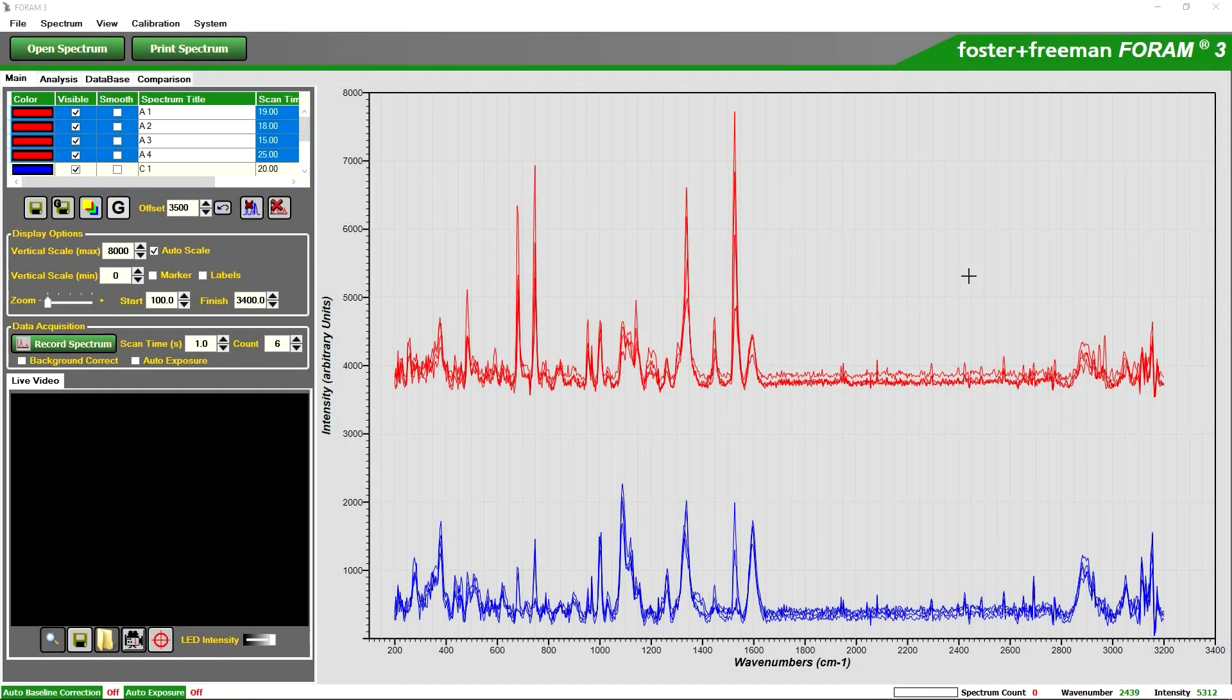In this example we were comparing a series of counterfeit 50 euro banknotes. Specifically we were analyzing the yellow stars on the front of the banknote themselves and trying to establish whether the banknotes were printed using the same printer.